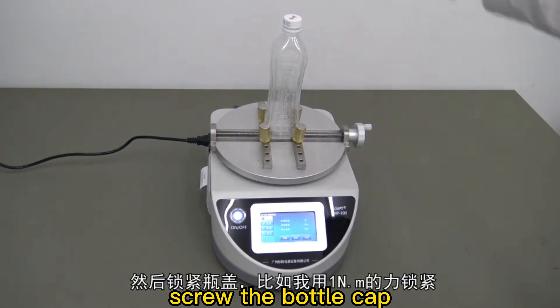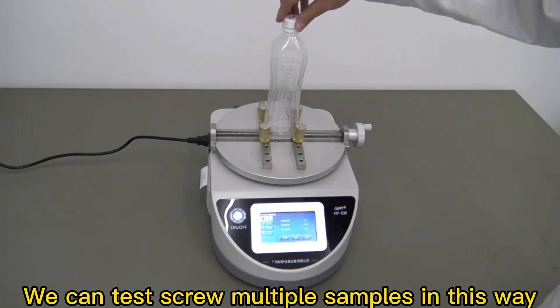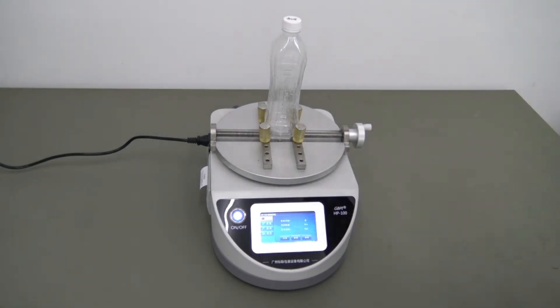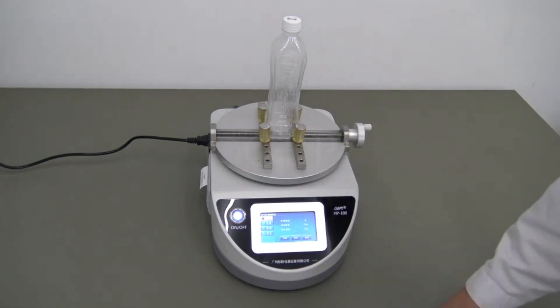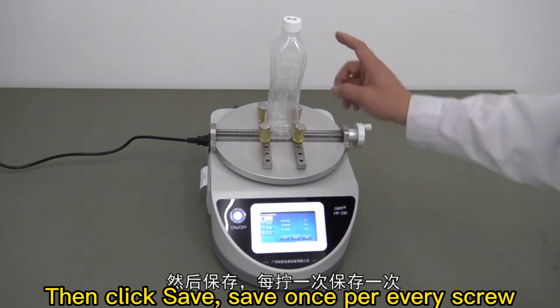Screw the bottle cap. We can test screw multiple samples in this way. Then click save — save once per every screw.